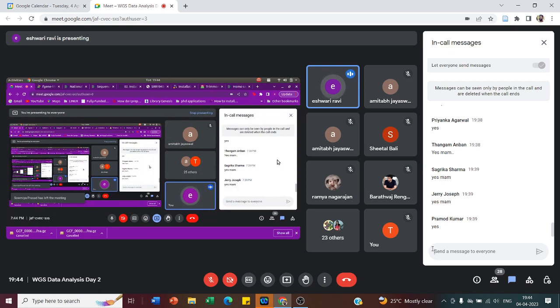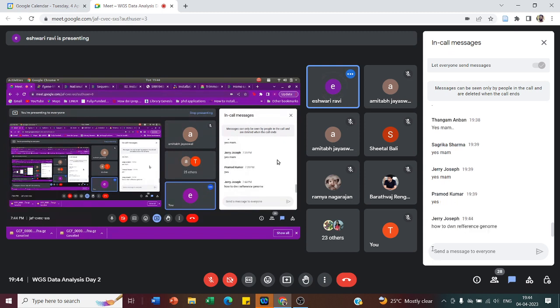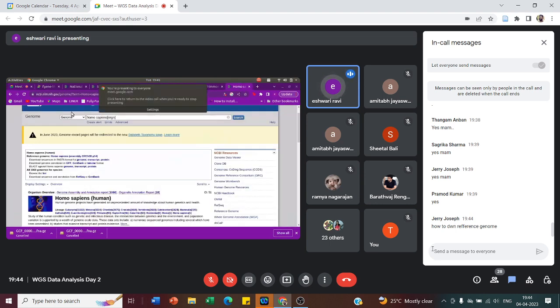Please let me know, I hope you are following this, or should I repeat some part? To download the reference genome, again, I will show. You can always go to NCBI Genome in Google and just type the scientific name for human. In this current workshop, we need Homo sapiens. I will share this link.